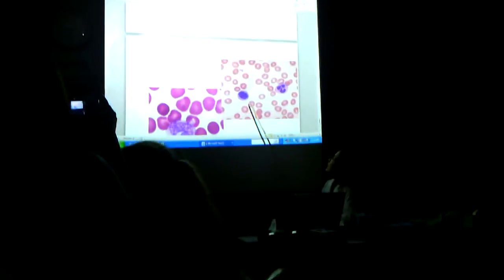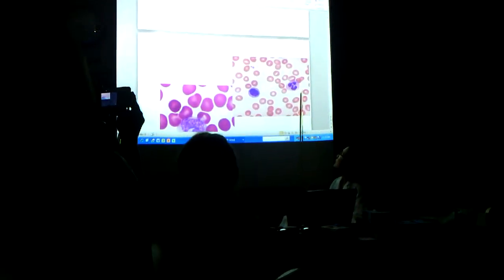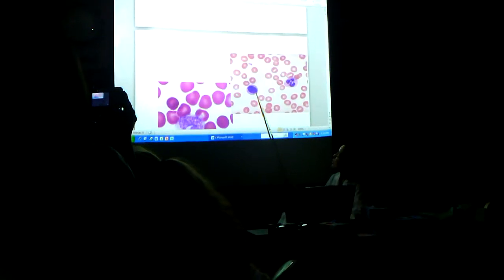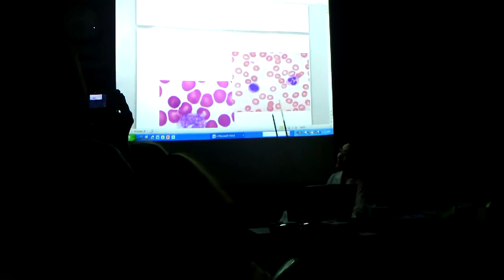And then this one right here, neutrophil. Usually it's kind of globular looking, neutrophil, the most common of all white blood cells. This is the smallest one of all. This is a lymphocyte. Notice that the nucleus is nice and round, taking up almost the entire cell. Lymphocyte.